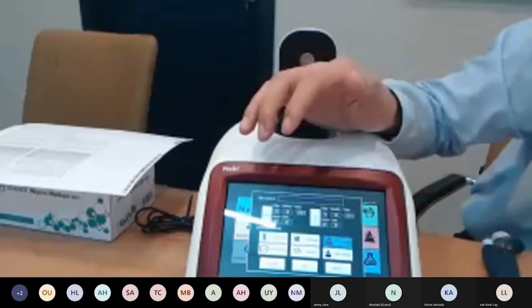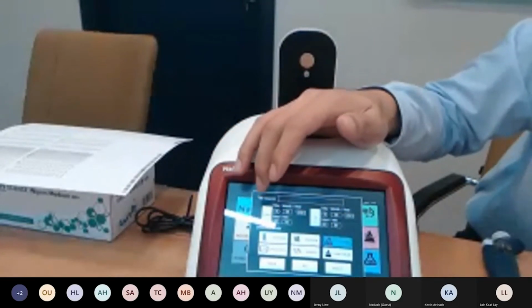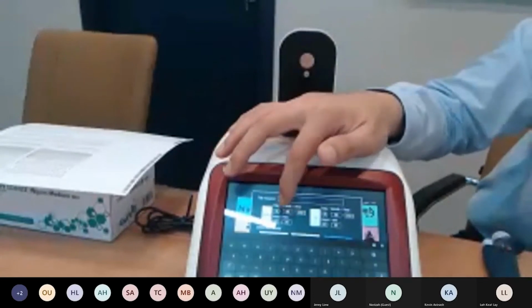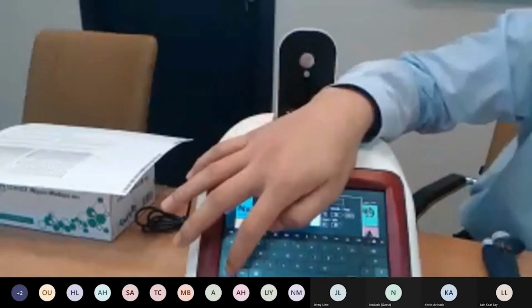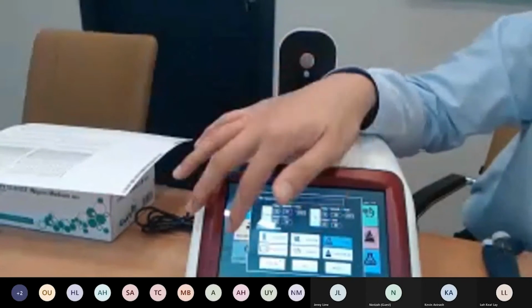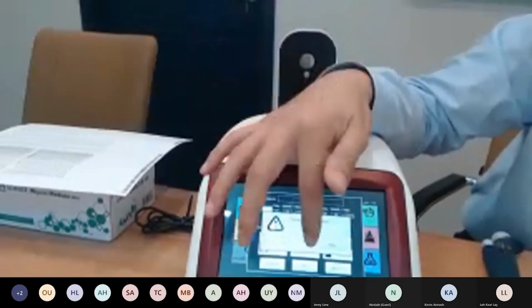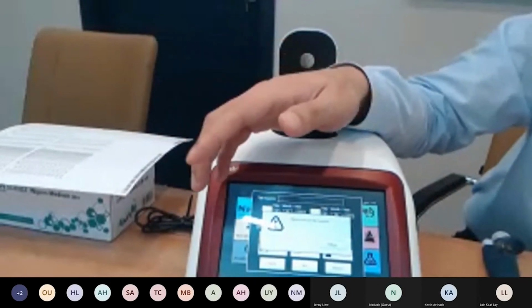So for OD6 group, you can also set the date, the time that you want to search between. So if you want to search between, let's say, from July 18th all the way to August 18th, then all you have to do is click that and click search. And obviously, since we didn't have any data at the time, it will say data cannot be found.